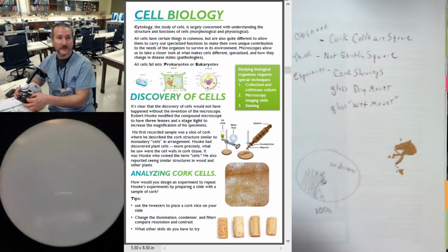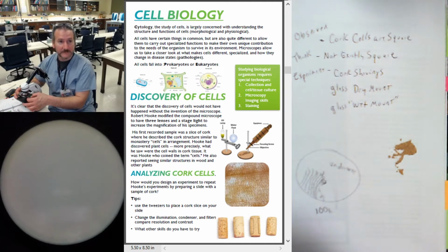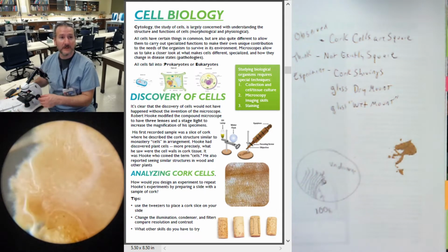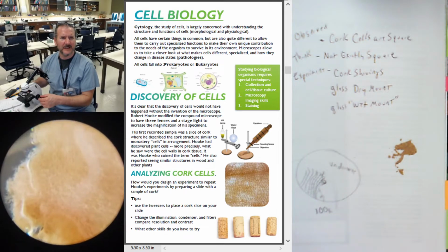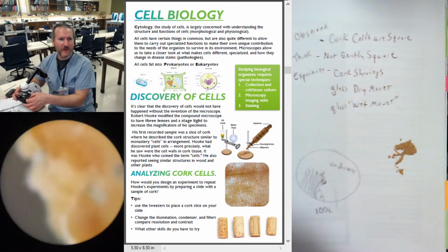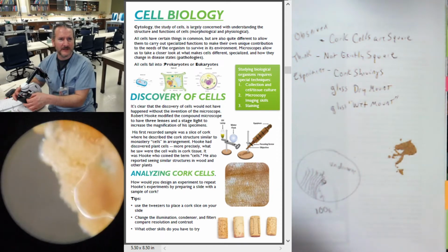Oh, too far, Shannon. That's all right. I'm going to slide back over to that big thin one that I saw before. I actually liked the craters without the water because the water kind of fills in all the holes. Ooh, that might be a decent spot.